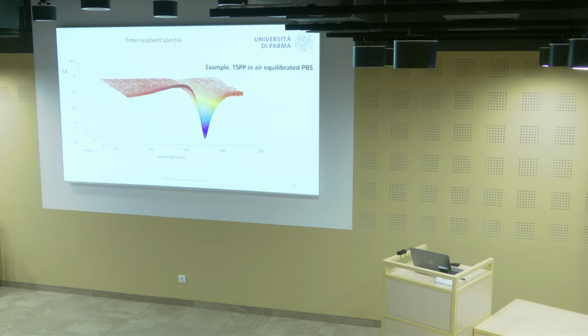Keep in mind, this is very useful to identify reaction intermediates that are different in terms of spectroscopic properties. But if you want to measure kinetics, the other methodology is by far the best. Single wavelength provides you with hundreds of thousands of data points for the kinetics. In this case, if you're lucky, you get 100, because it takes a long time to collect these data.